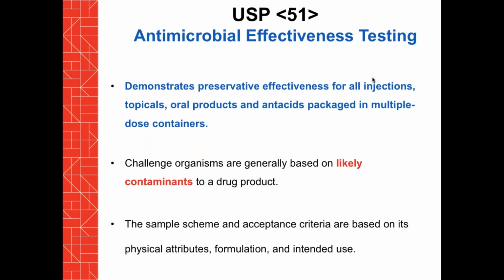An example of the product that must be tested for antimicrobial effectiveness is a multi-dose vial containing a sterile drug product. Another example I like to use, and this one would be applicable to non-sterile drug product, is a skin or face cream. Sometimes these are packaged in small tubes that require the end user to use their hands to withdraw the product from that container. And the purpose of the preservatives in this type of product is to ensure that microorganisms from the user's hands cannot grow once they have been introduced into the product.